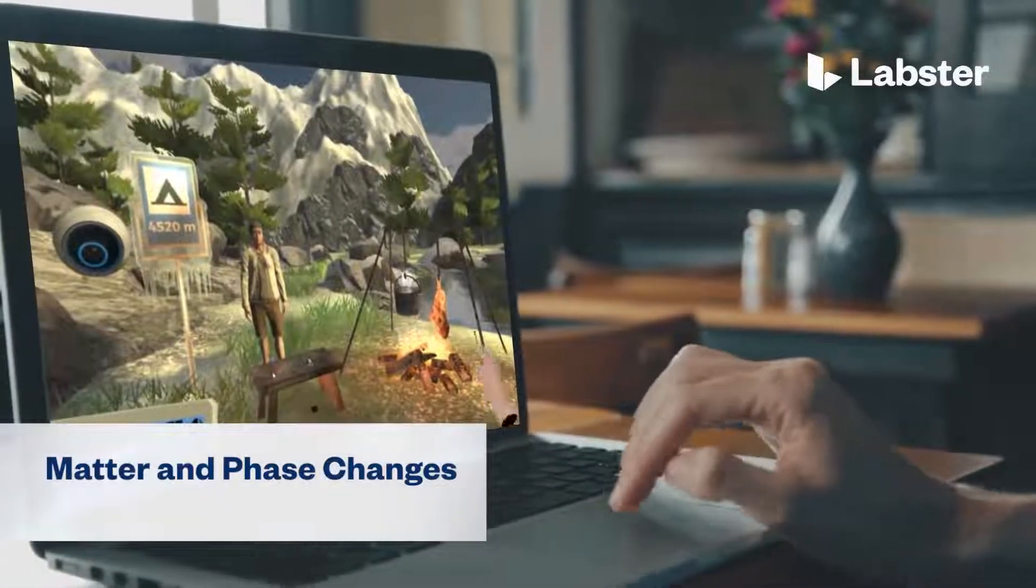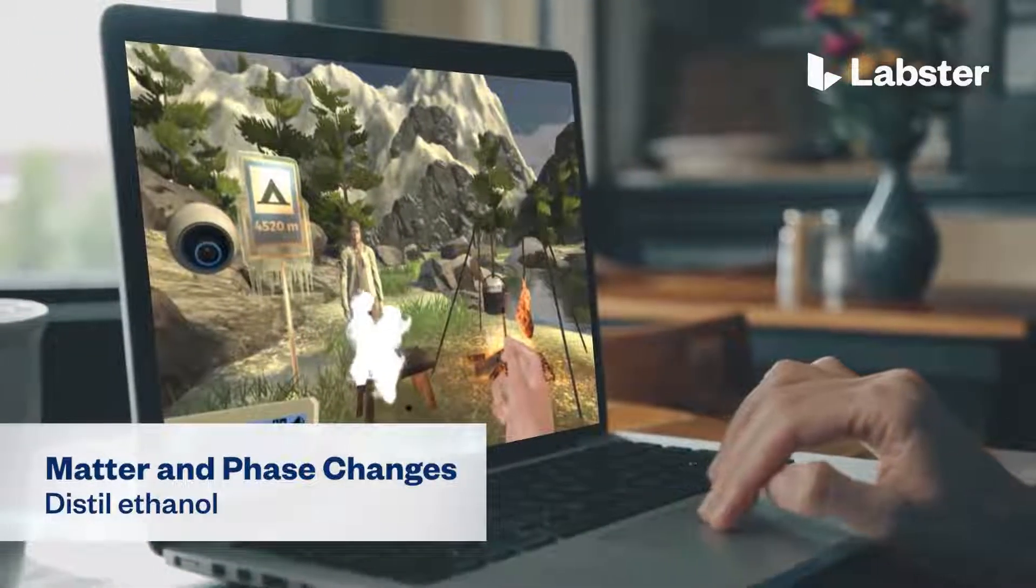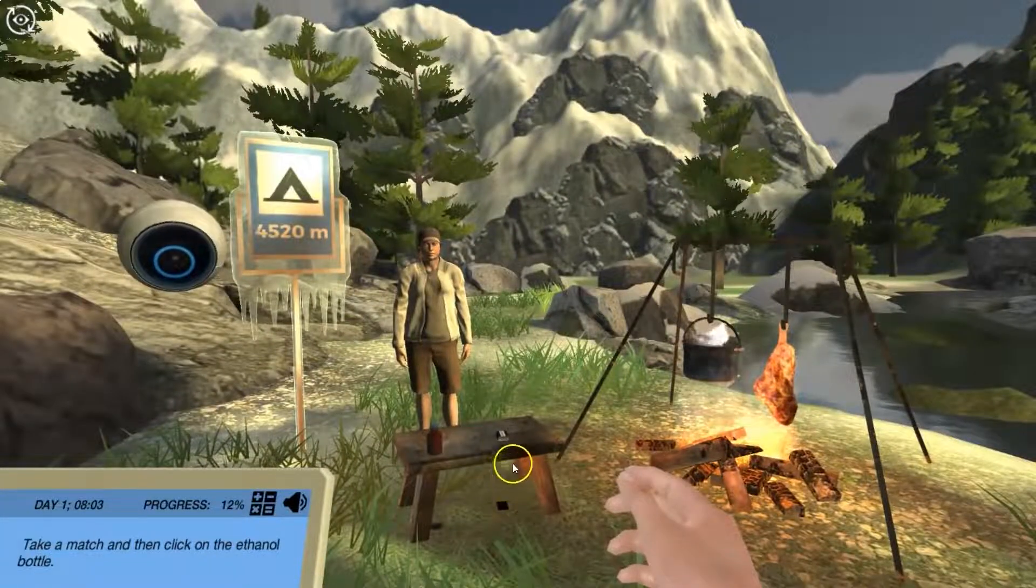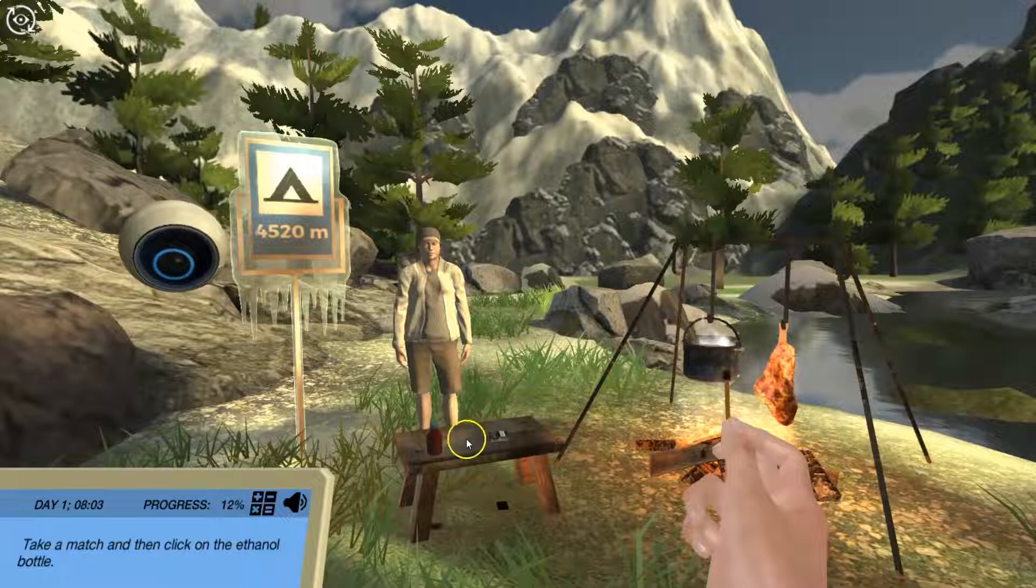In the Matter and Phase Changes, Distill Ethanol Virtual Lab, students step into a realistic lab experience where they can practice, learn, and explore science in an engaging and immersive way.